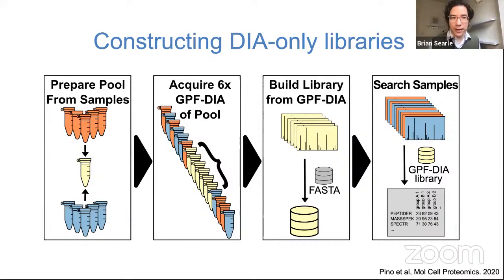They're different peptide sequences, but we know where they should be on the retention time scale, even the same IRT scale. So you can use those as your retention time standards as well. We also know the retention time standards for many of the different peptides in the human proteome already. We know what their appropriate IRTs ought to be, so you can use just those peptides as your retention time standards as well.